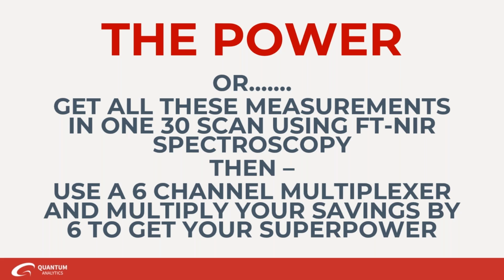What you can do is see samples that really don't fit into the model. You might have noticed, and I didn't really touch on this, that some of the model graphs I showed you had a couple of red dots on them, and that probably did mean they were outliers, that didn't fit the way the rest do for some reason. So, you can pull all the samples that it says are outliers out of your model and then recalculate it.